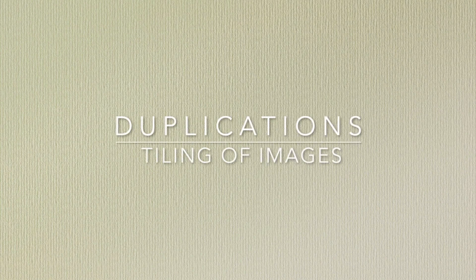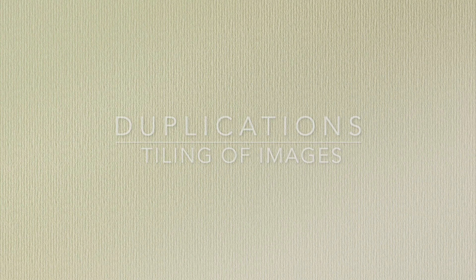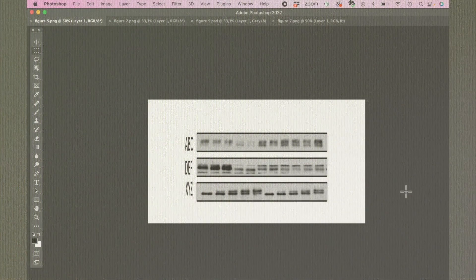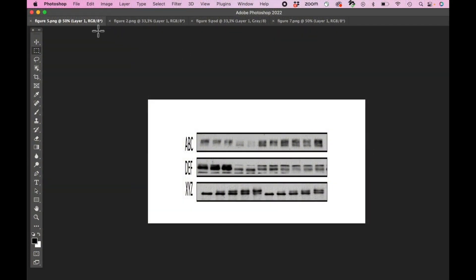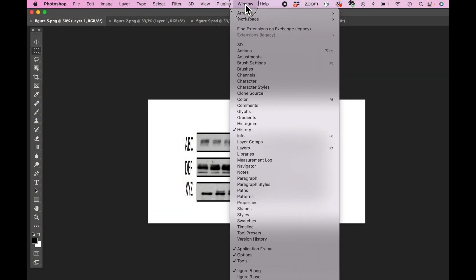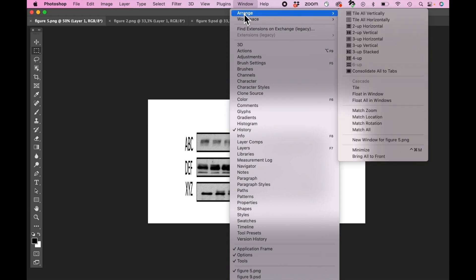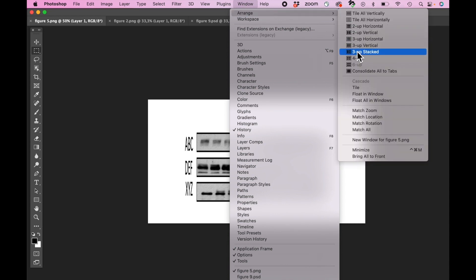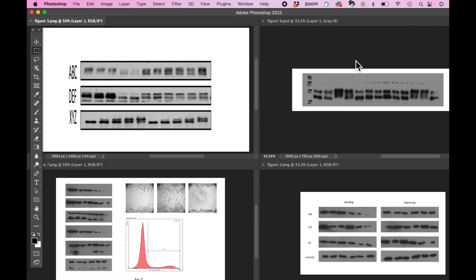When the manuscript you're investigating has several figures that contain blots, these should also be compared to each other to check for duplicates. It helps to tile the individual files in Photoshop and look for similarities. This is also very useful when comparing figures to raw data.